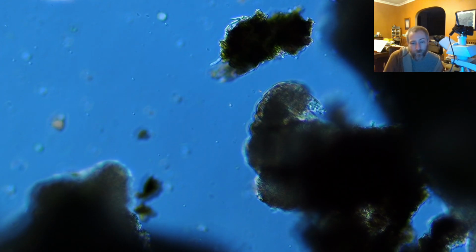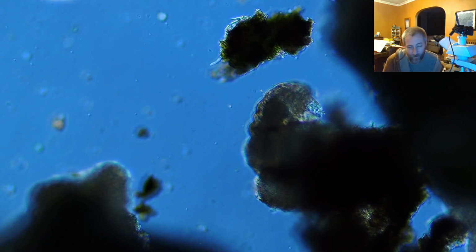They're in their cryptobiotic state, so they hibernate through those environments. And then, when they get to the other side of it, when the conditions go back to something a little bit more reasonable for them, and they get wet, they come back to life. So they view that as having lived through that environment.